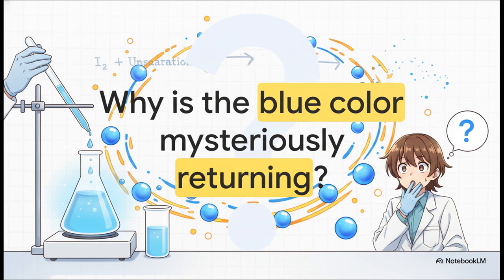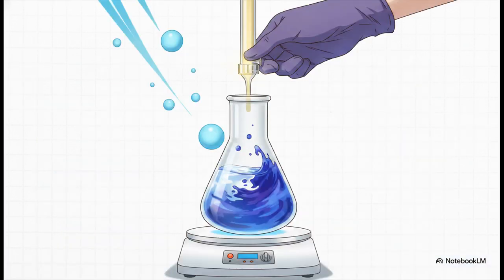What on earth happened? The culprit here is atmospheric oxidation. If you're titrating too slowly, oxygen in the ambient air can actually oxidize the iodide ions right back into iodine. When that fresh iodine hits the starch still lingering in the flask, the blue color's back. The solution? Titrate promptly, decisively, and ensure you're mixing thoroughly on a magnetic stirrer.